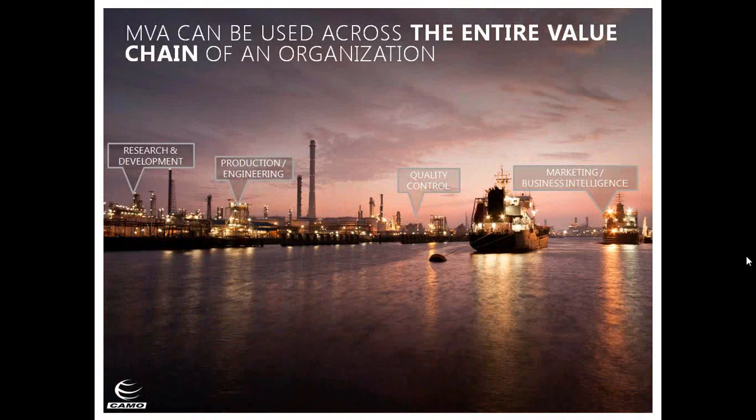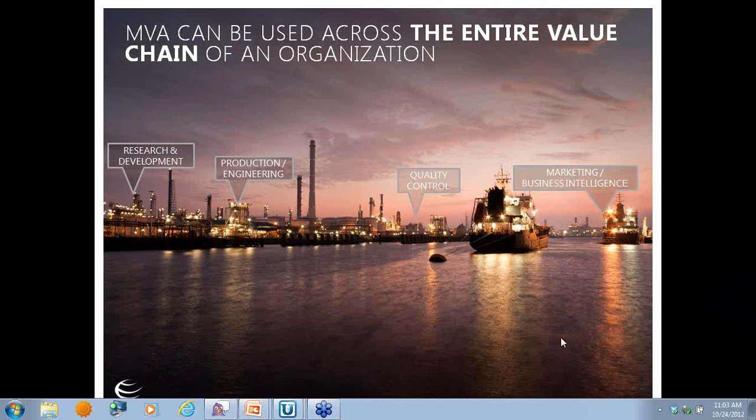Over the years, the Unscrambler has been used in essentially all market areas and verticals, from chemical, food and beverage, agriculture, energy, and pharma. And the Unscrambler can be used in various functions across an organization, from R&D to product development, QA, QC, and process analytical technology, just to name a few.